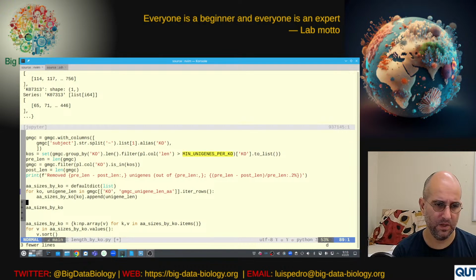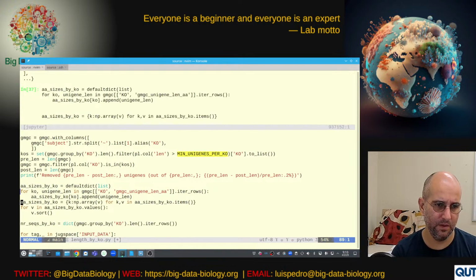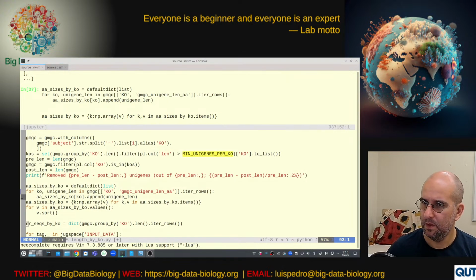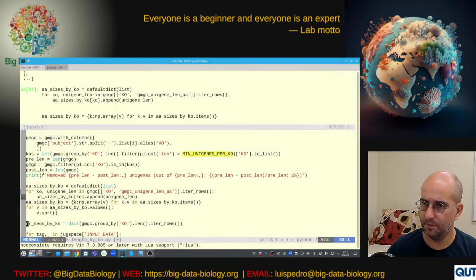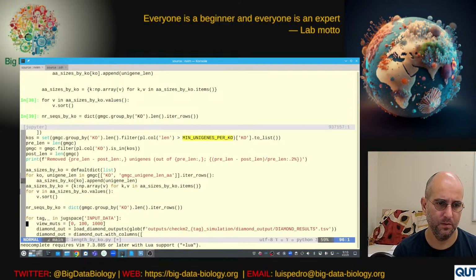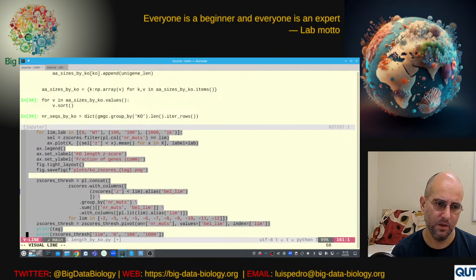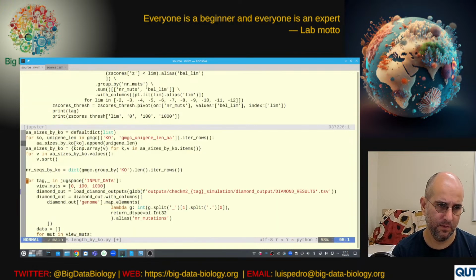Okay, I don't think this actually makes it that much better, and it's not particularly faster. Okay, let's forget about that. This works perfectly fine. All right, so a little bit of a detour, just looking at the number of sequences. Okay, and this is what we've been doing the whole time, looking at this.